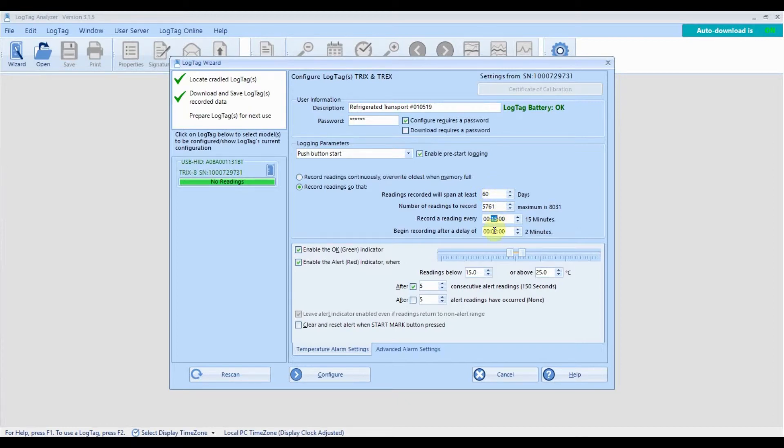You can enter a start delay. Adding a start delay helps prevent false alarms by allowing your logger to adjust to the fridge or freezer temperature before recording starts.